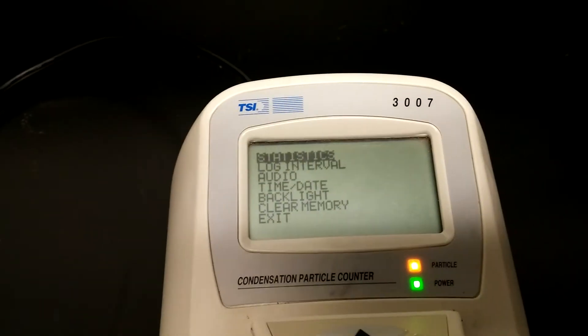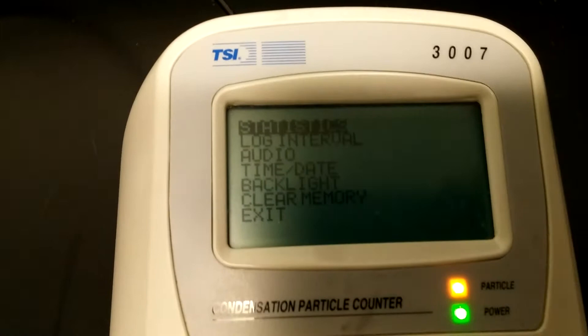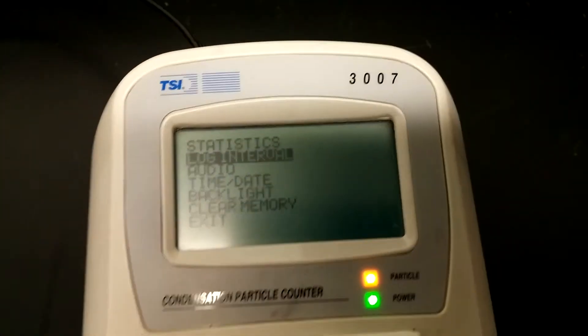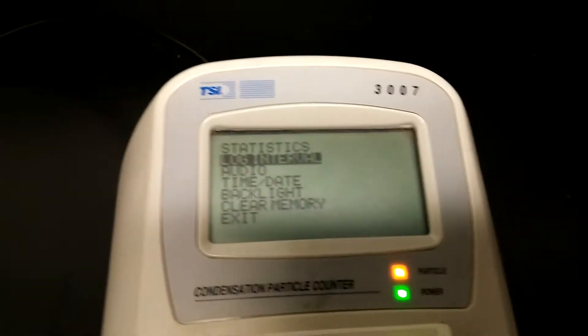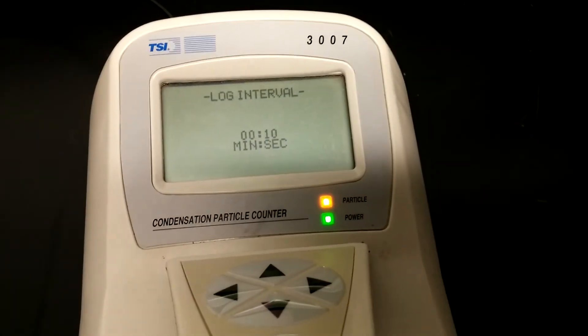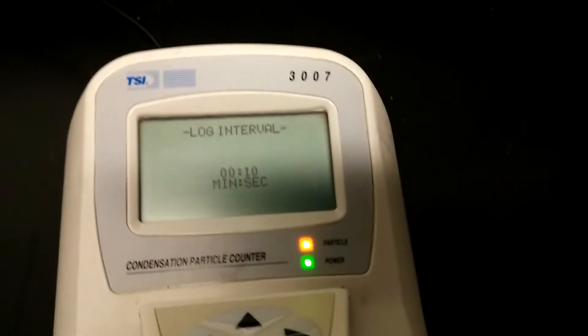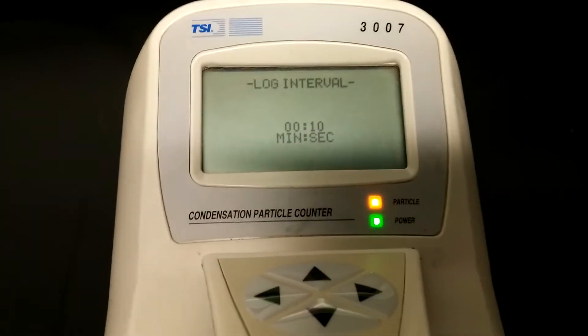You will see several settings that you can choose from. Press the down arrow once so that 'Log Interval' is selected, then press the enter key. You will see the displayed logging interval — that is your current selection. If you press OK, that would be the selection you make. 10 seconds is what you're most likely going to use.